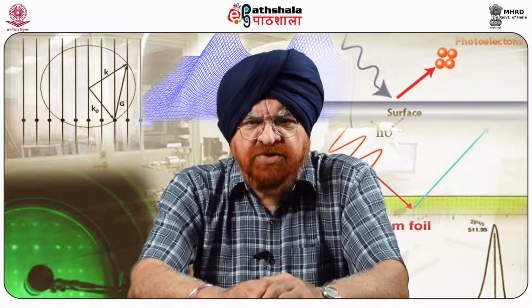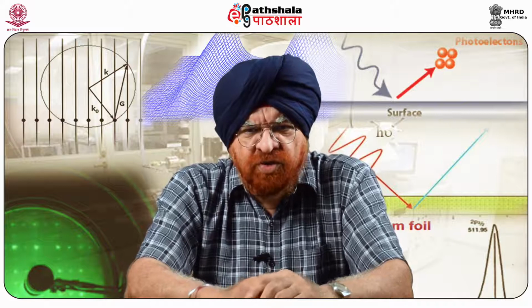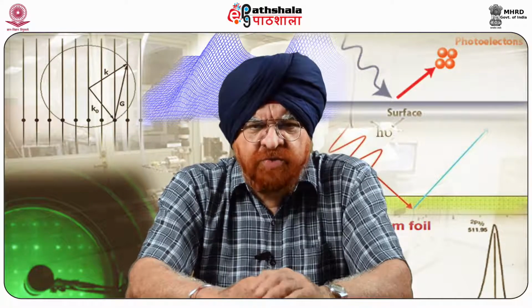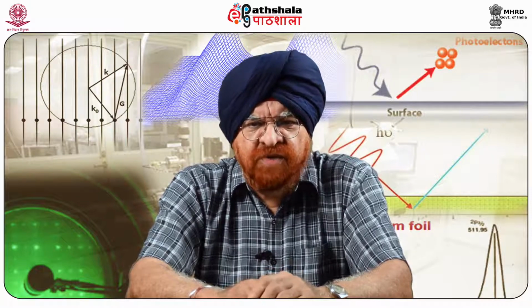Today we are going to discuss the module Chemical Force Microscopy, under which we shall talk about the introduction of this topic. This comes under the paper of Surface Analytical Technique Part 1.